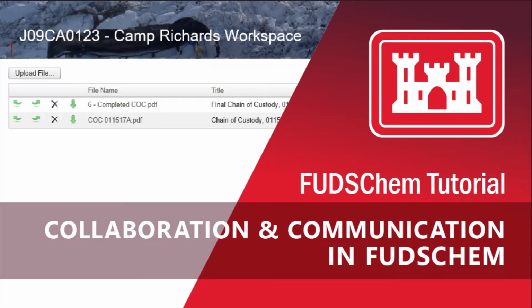This video will go over the tools that are available for collaboration and communication in FUDSChem. It will include how to send automatic notifications to other users, how to leave comments, and how to use the project workspace to share files with your team.